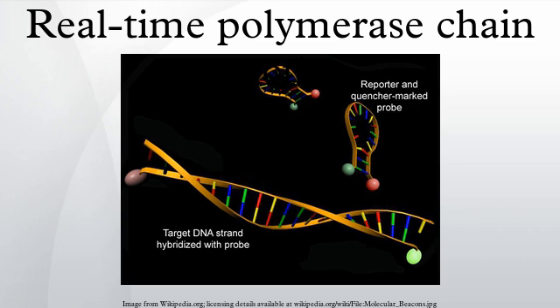This normalization procedure is commonly called the ΔCt method and permits comparison of expression of a gene of interest among different samples. However, for such comparison, expression of the normalizing reference gene needs to be very similar across all the samples. Choosing a reference gene fulfilling this criterion is therefore of high importance, and often challenging, because only very few genes show equal levels of expression across a range of different conditions or tissues.